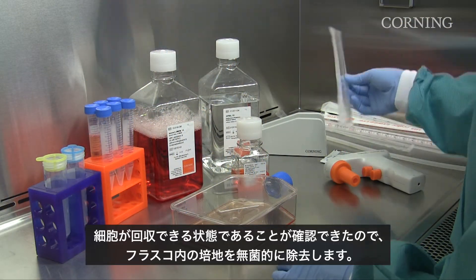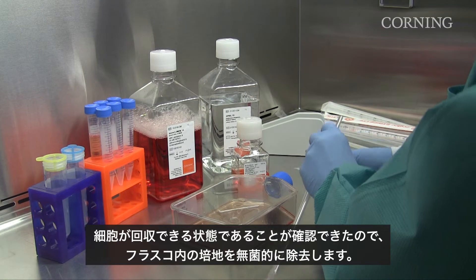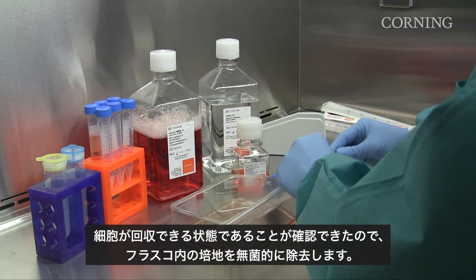Now that we have determined the cells are ready to harvest, we will aseptically remove the media from the flask.